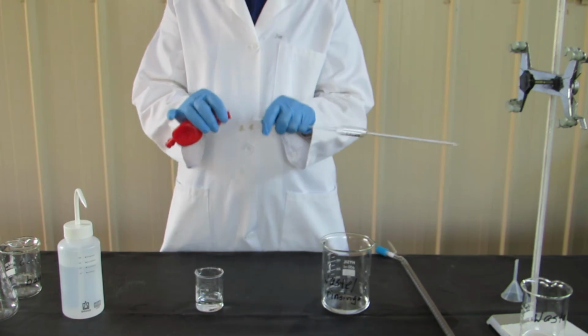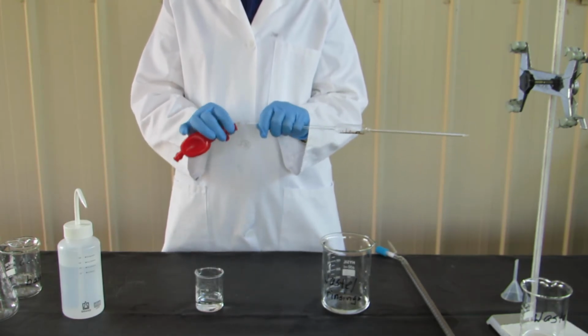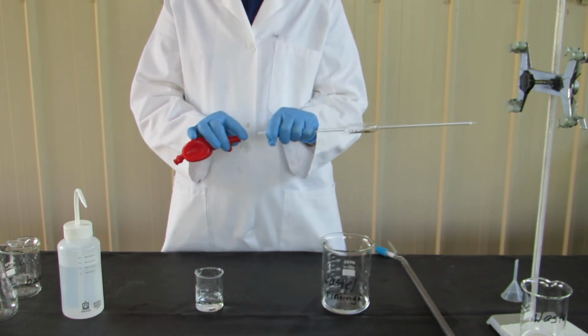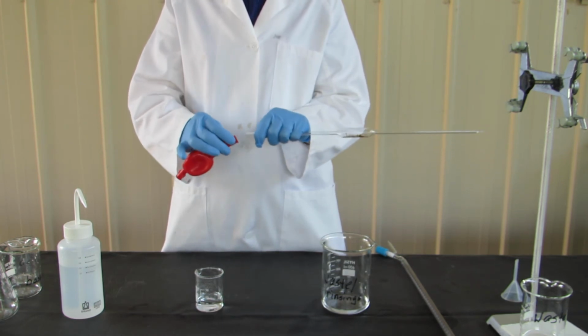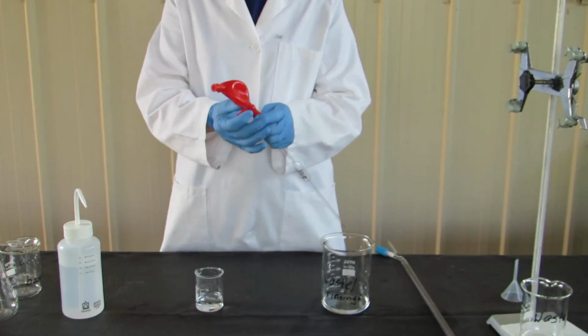You then need to place the pipette into the bottom end of the filler. This is the most dangerous part of a titration. You must make sure to hold it right up the end. Just push gently into the filler. It doesn't have to go in very far.